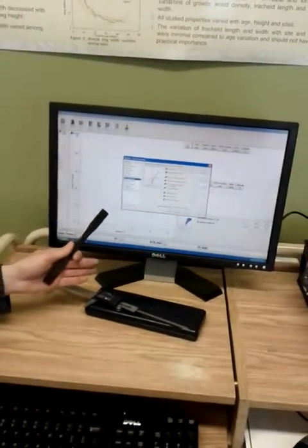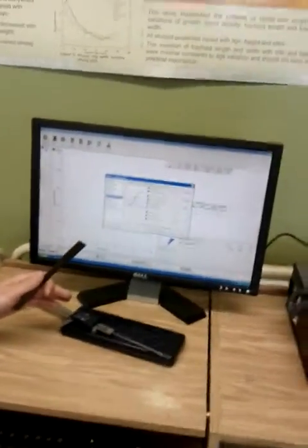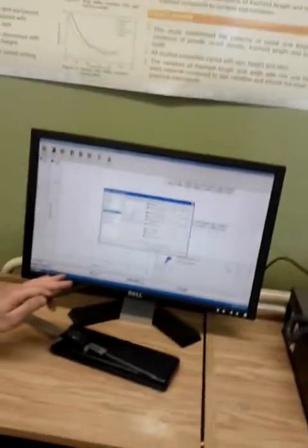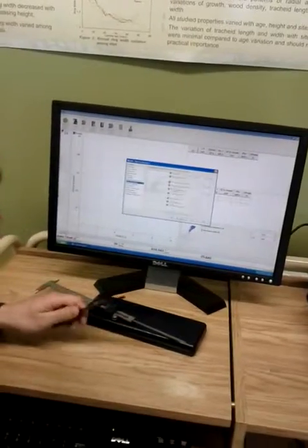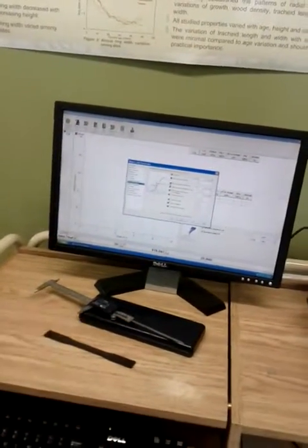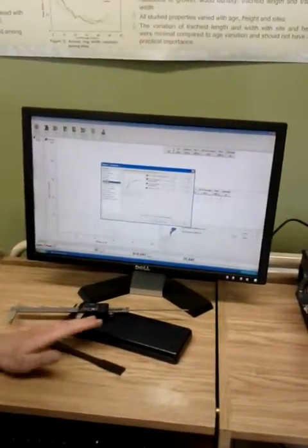Unless you need something specific, unless you have a standard that specifies something else, it's constant speed. In my opinion, there should be only one speed, because some students forget one of the three places, and then the test goes slower and faster and slower and faster, and the curve is weird. So just make sure you have the same speed everywhere.